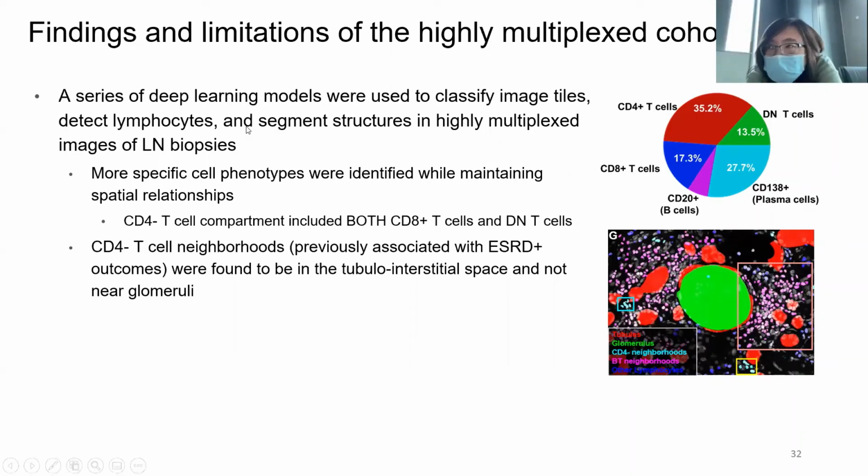So I have a quick question. The TB neighborhood looks really interesting. For the inflammation in the tissue, the fibroblasts are also really involved in driving the tissue inflammation, right? Called tissue priming. So how can you capture the mesenchymal immune interactions in the colocalization using the imaging? Because now we can only do a limited set of features, right? So how can you detect more such neighborhoods and colocalization related with tissue inflammation?